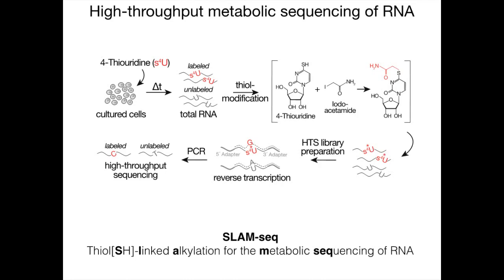Now, what I would like to do in this webinar is to show you how SLAMseq enables cost-effective insights into intracellular RNA kinetics at really an unprecedented accessibility, efficiency, and scalability, and therefore represents a powerful tool for the dissection of fundamental biological mechanisms that control gene expression.